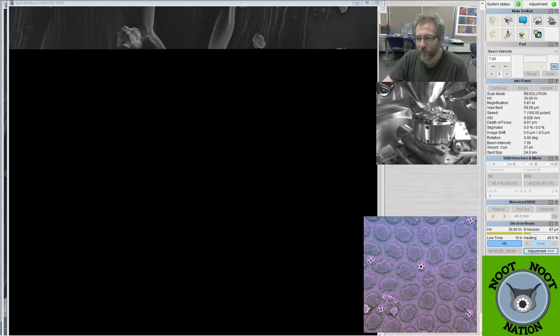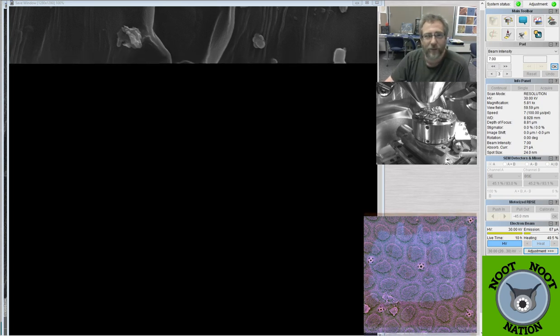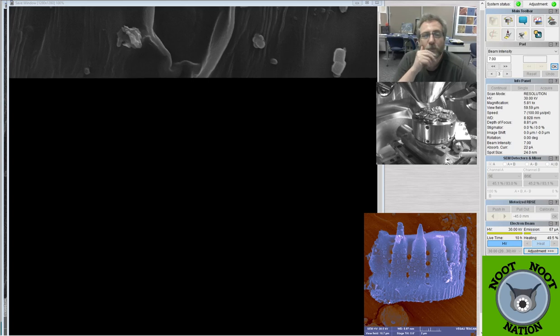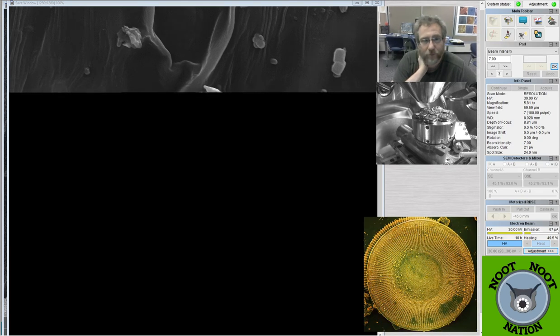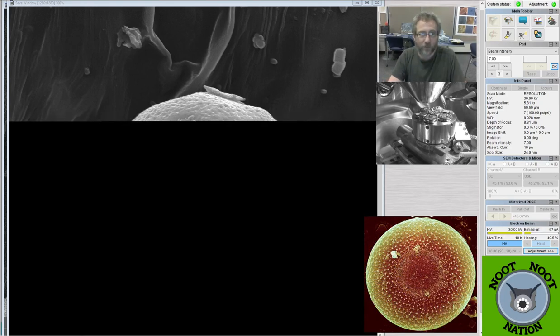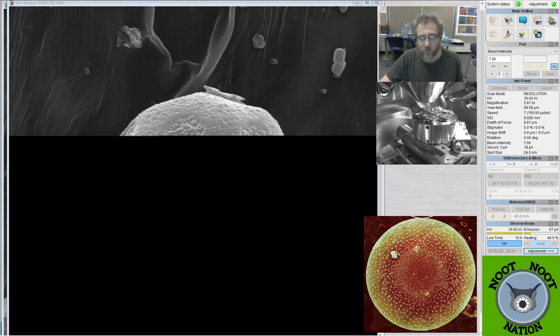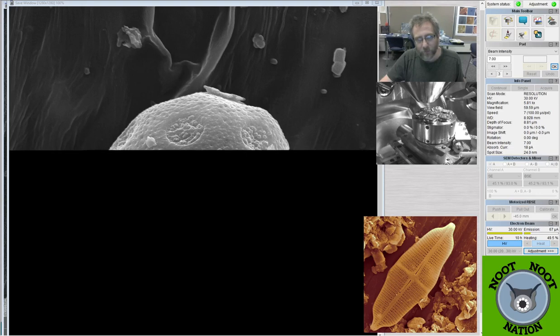Plantain? I don't think we have any plantains here, Pacific Plankton. It would be weird to have plantain pollen. I don't know, what is water plantain? I'm only familiar with the kind people eat. Melisma? Could be.